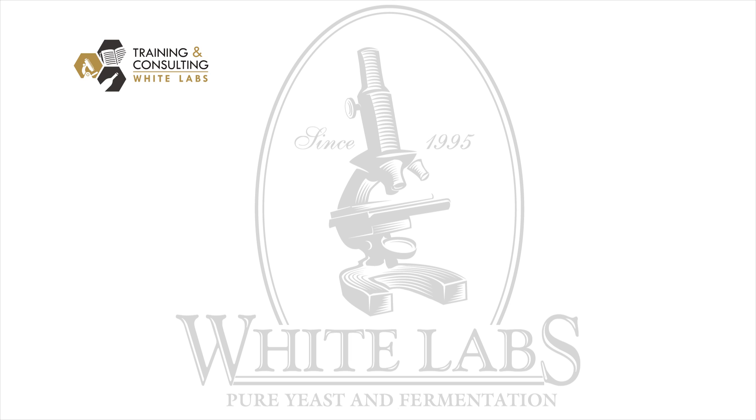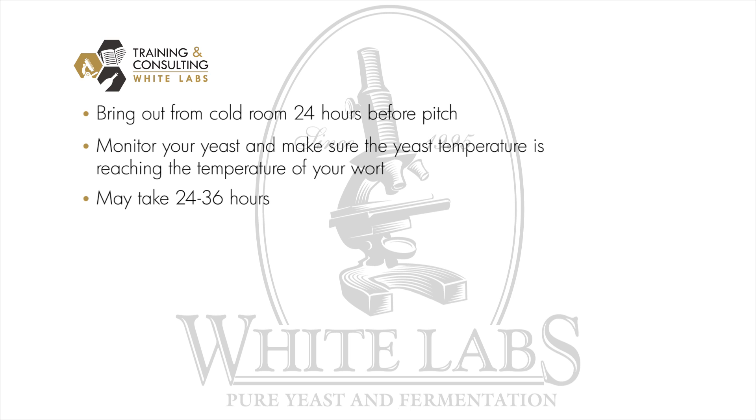Now I'm going to go over how to pitch using the firm flask. Bring it out of the cold room approximately 24 hours prior to pitch and monitor the temperature in the yeast as it rises to match the temperature of the wort you're going to pitch. This can normally take 24 to 36 hours.